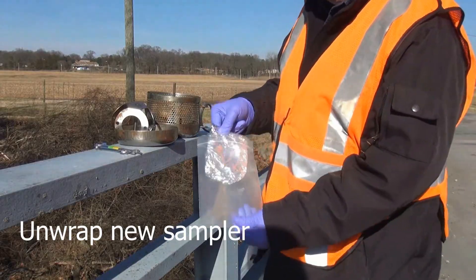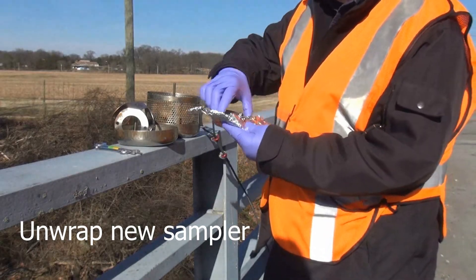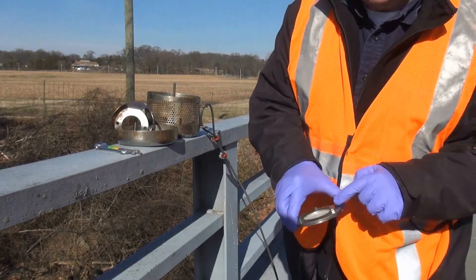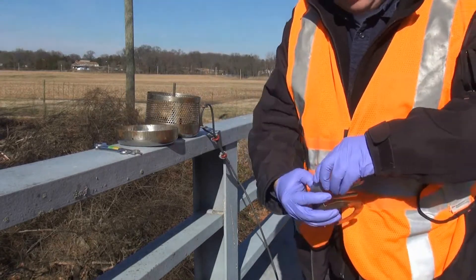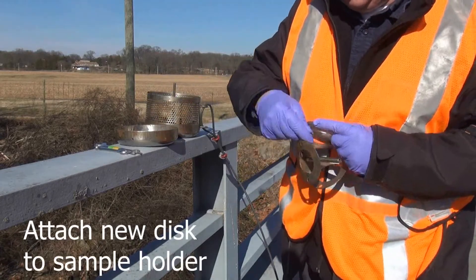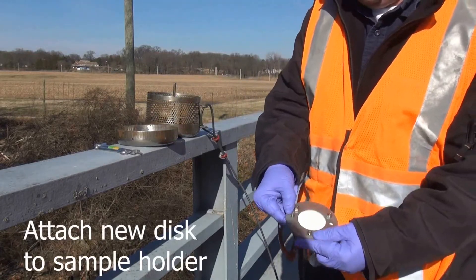Now reverse the steps to deploy a new sampler. Unwrap the new disc, remembering to only hold the metal rings. Attach the disc to the sample holder with the hex nuts and bolts.